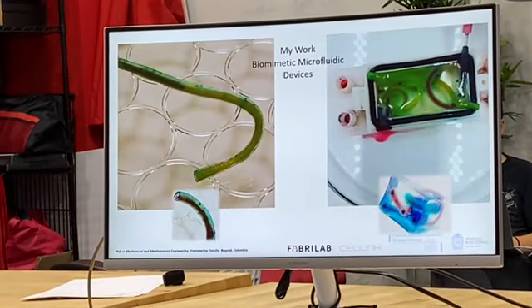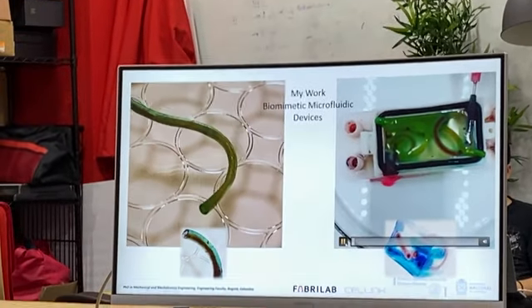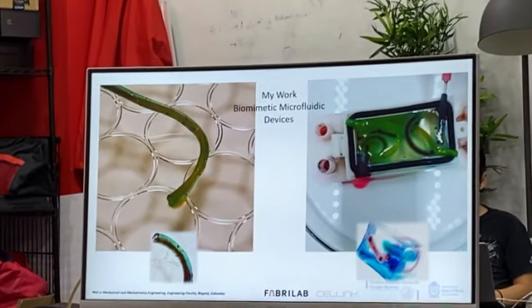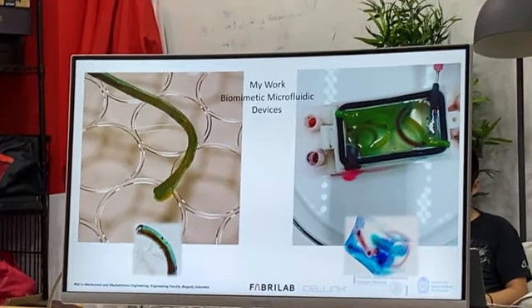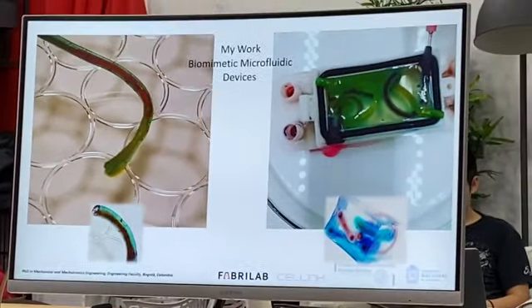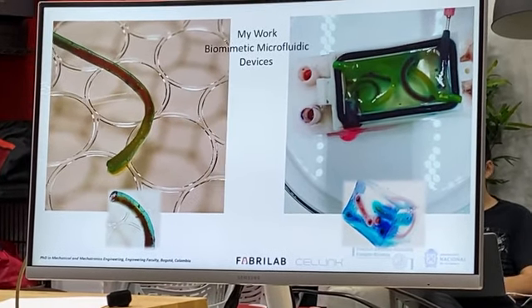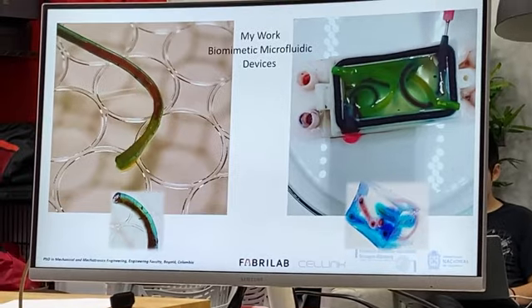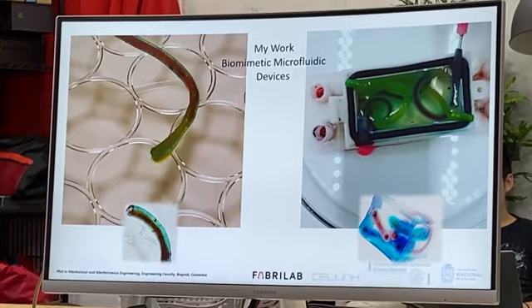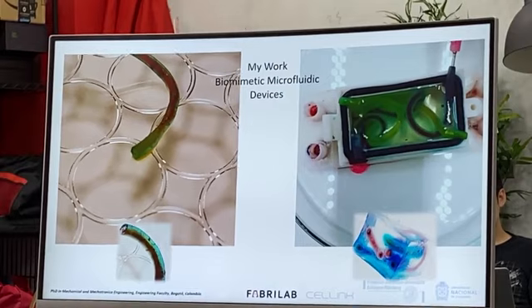Here are two videos that I want to share with you, just showing what is possible to print with that coaxial nozzle. So, after the preclinical testing and the implantation on animals, you have to validate that it works, of course, and that the development is biocompatible and you can implant that in human beings, right?